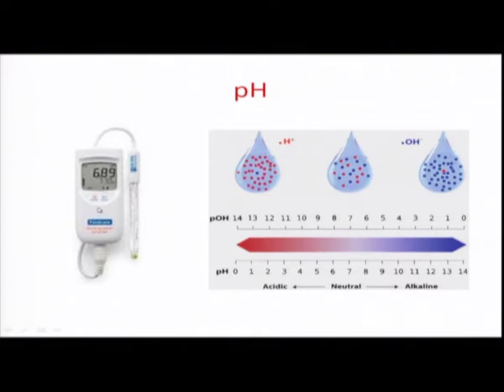The technique used for measuring pH is the electrometric method. It is a potential measurement using an H plus ion sensitive electrode, that is a glass electrode in the laboratory. Even nowadays it is available as a pen type, just like a pen, you can put it in a pocket, go to the field and measure the pH with a pen type pH meter. That type of improvement has taken place. You need not bring the water to the laboratory, you can measure on the field.